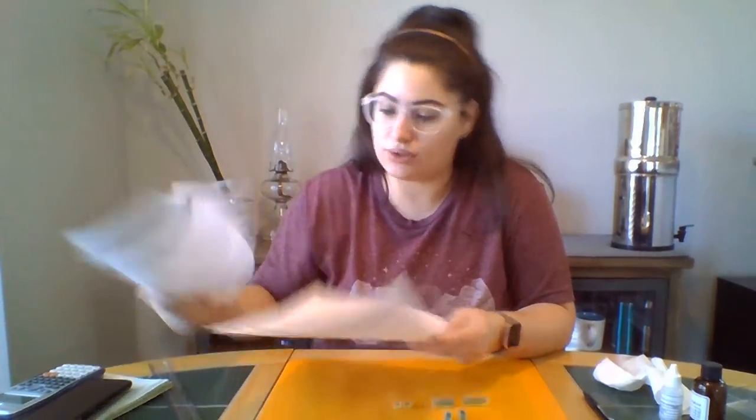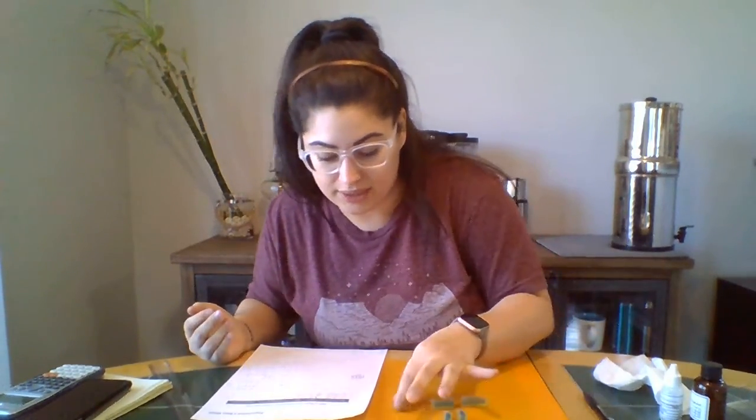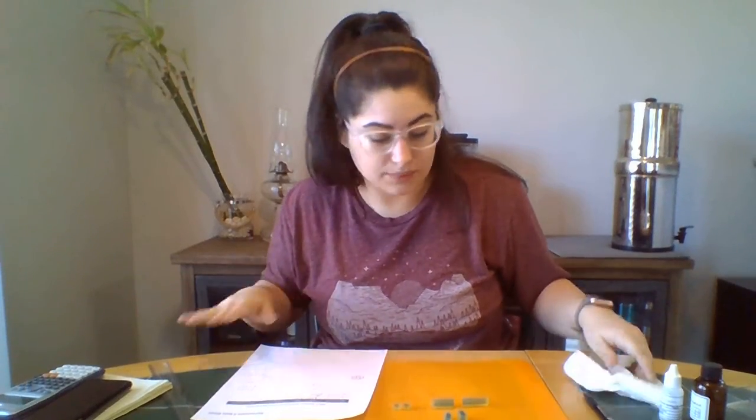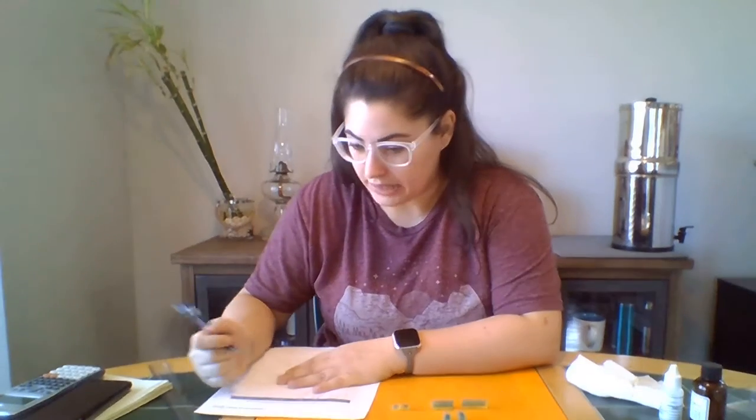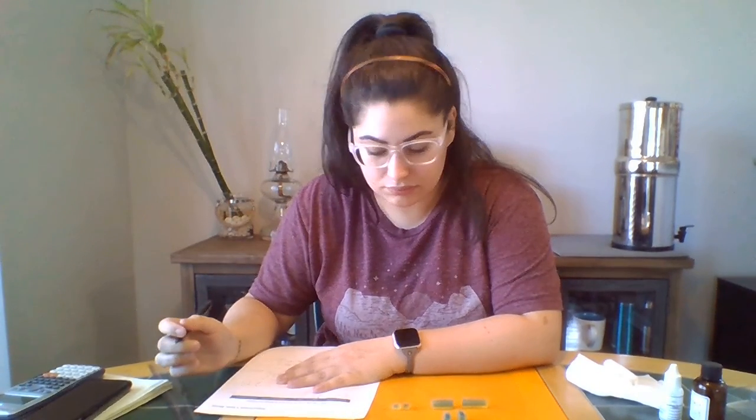So what did it say to do? It's after 7 minutes, generally, but then cut them in half using a kitchen knife. Measure the distance of vinegar diffused into the gelatin cube as indicated by the color change. Record that value in table 2. Okay. Time required for complete color change. Well, they didn't complete. None of them completely changed color. So I guess not available.